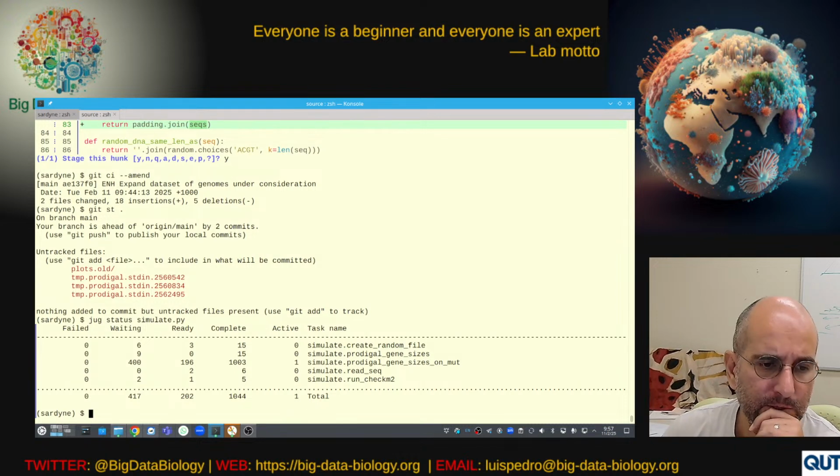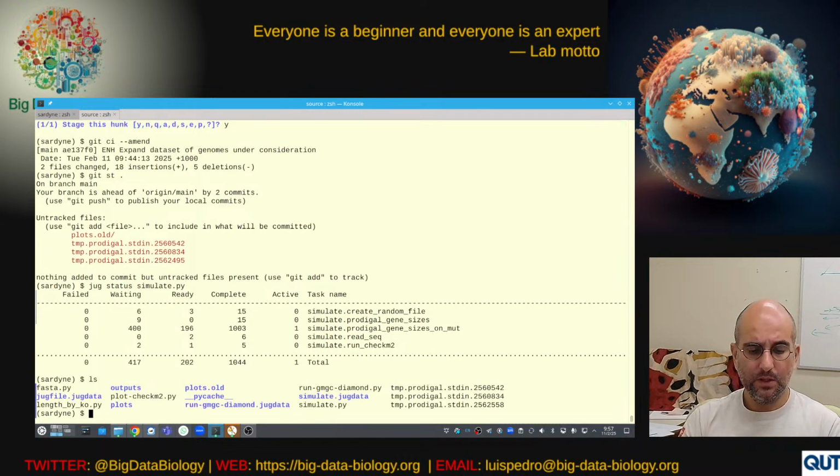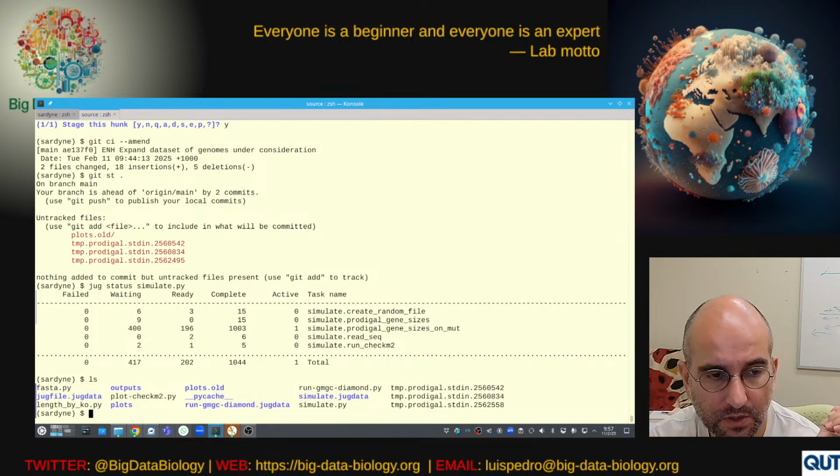As usual, I will let this run, and then when I do the recap, I will show what the outputs are. In the meanwhile, we also downloaded the MAGs from the dog study, which we will start looking at next week.